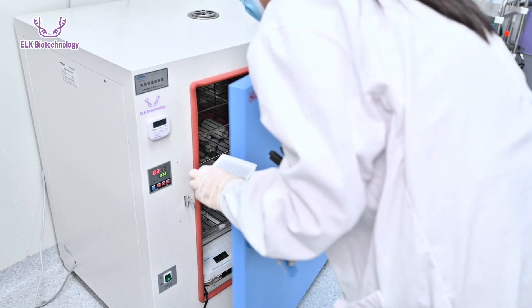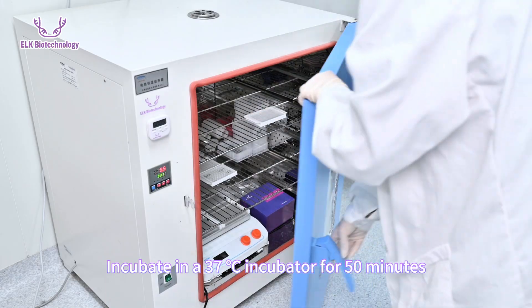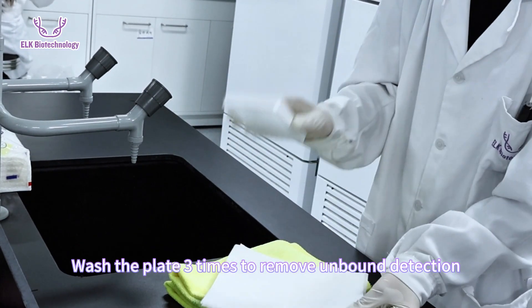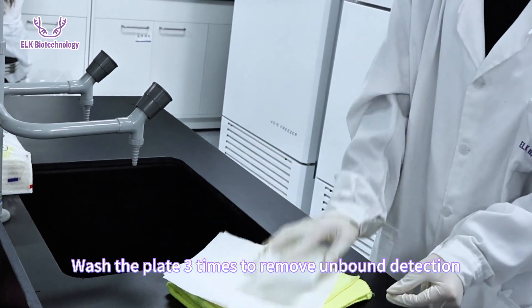After dispensing, incubate in a 37 degrees Celsius incubator for 50 minutes. Once detection antibody incubation is complete, wash the plate three times to remove unbound detection antibodies.